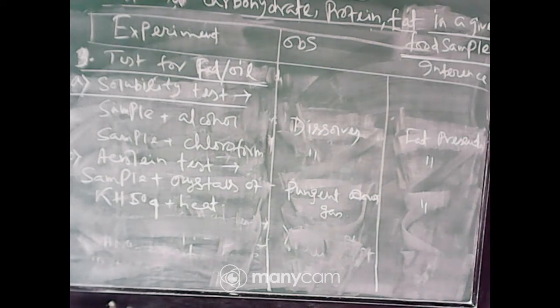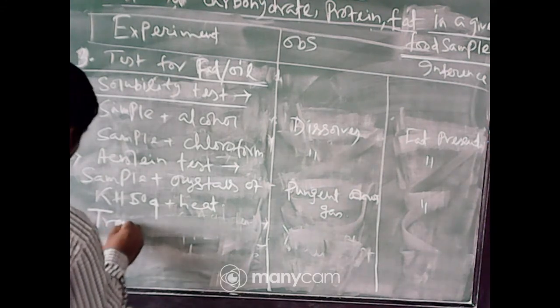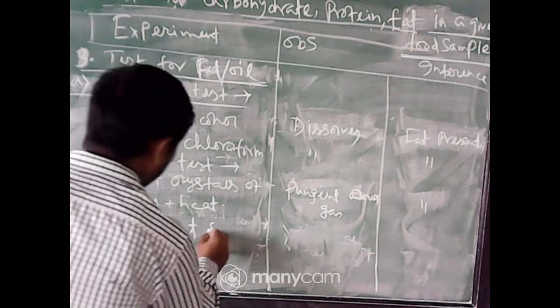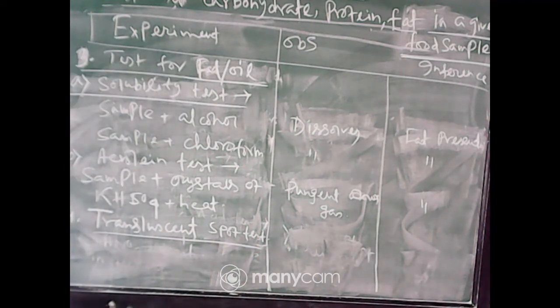Okay, now write down another experiment. Translucent spot test.